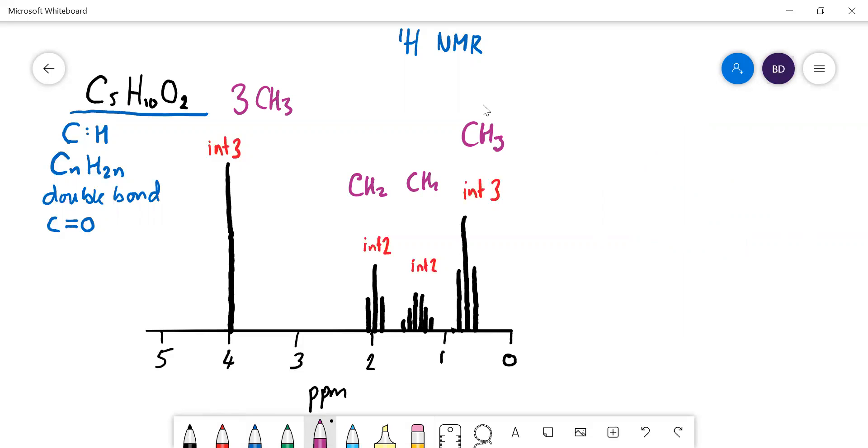We've got two oxygens in there, so it's quite likely we have got an ester linkage. It might not be an ester linkage, it could be a ketone and then an ether linkage. But these hydrogens here are attached to a carbon which is next door to an oxygen, and that would give a ppm of about four. We'd have to have two peaks of ppm about four, and we've only got one, so I don't think it is an ether. I'm pretty sure this is going to be an ester.